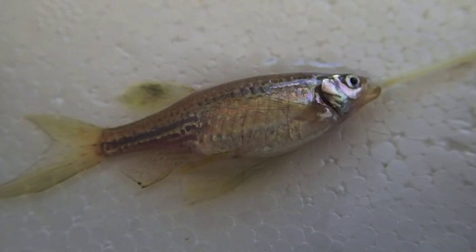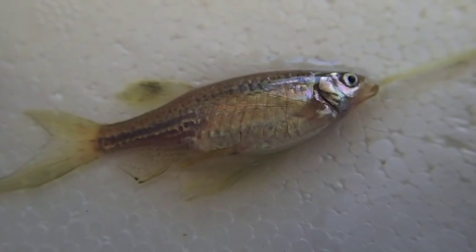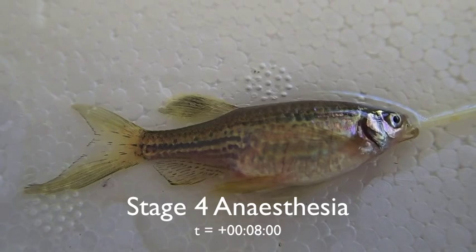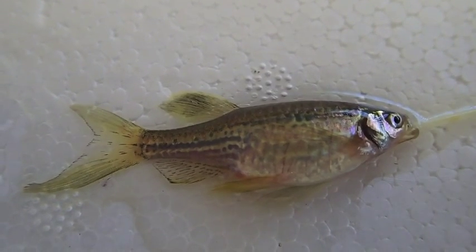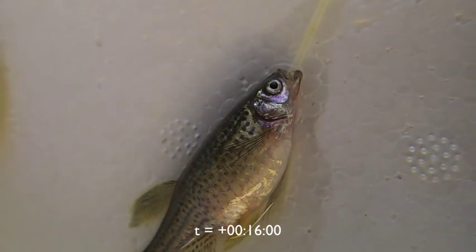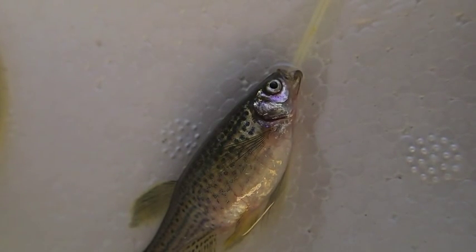Here you can see that the respiration rate is much increased. And here, about 8 minutes into the circuit, we're in stage 4 anesthesia — you'll notice the gills are a lot more regular. At 16 minutes into the anesthesia, the gill covers are a lot slower but still regular.